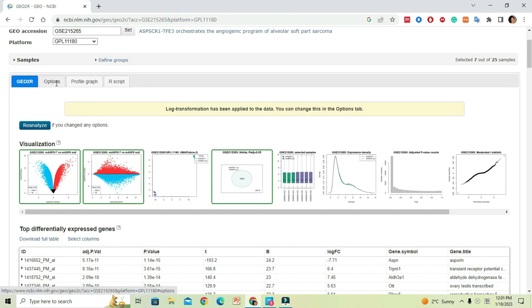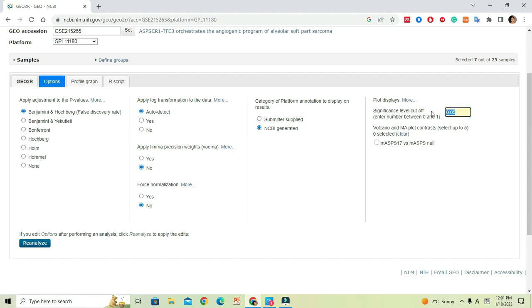To change the options for calculations, you can go to Options and select your preferred choices for p-value determination, log transformation of data, the limma precision weights, force normalization, the platform annotation to display on the result, and also the cutoff p-value. You can set these here and press Re-analyze, and the results will adapt based on your selected parameters.